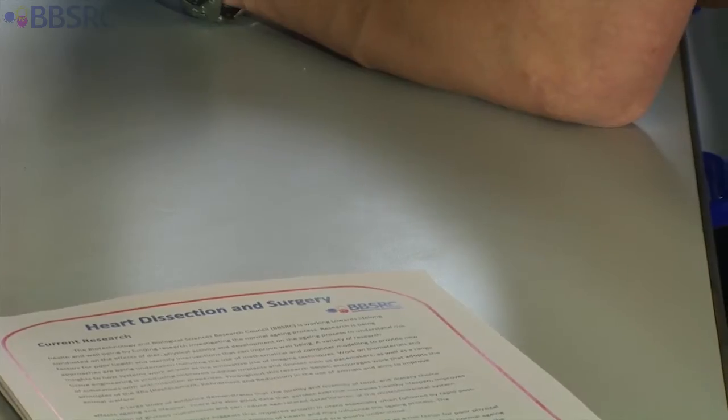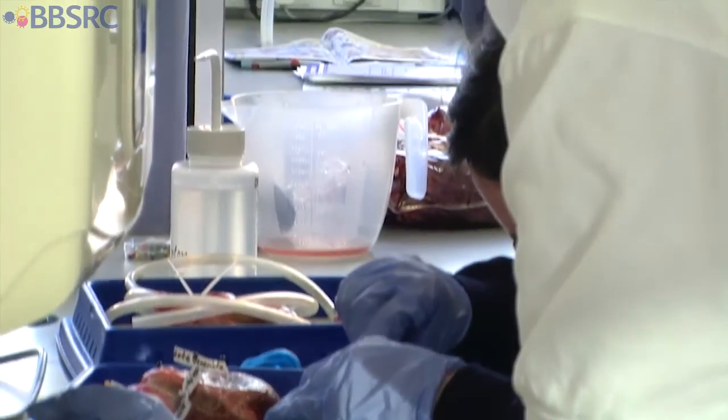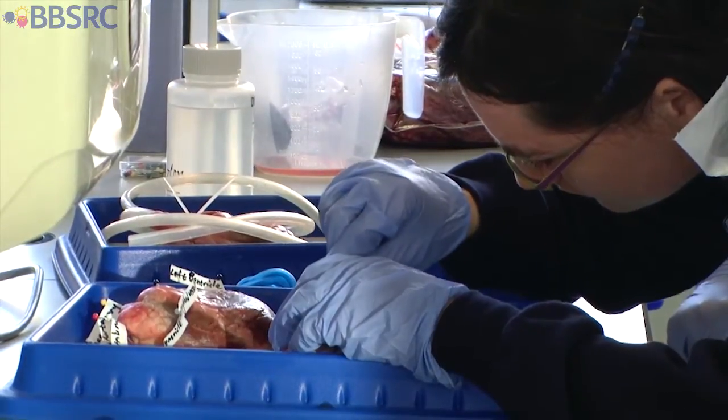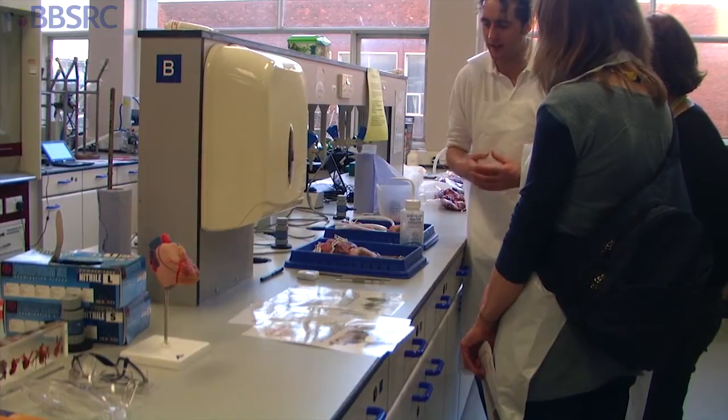Here today I've been helping the BBSRC with heart dissection. Sometimes hearts are damaged when you get them from the butcher's, so we've been working on a new part of the process where you can sew up holes in the hearts with dental floss and curved needles. Then you put water through the arteries and veins back through the hearts to see how good the repairs are. The idea is to encourage students to be more constructive in their heart dissection approach. I think it's gone really well today.